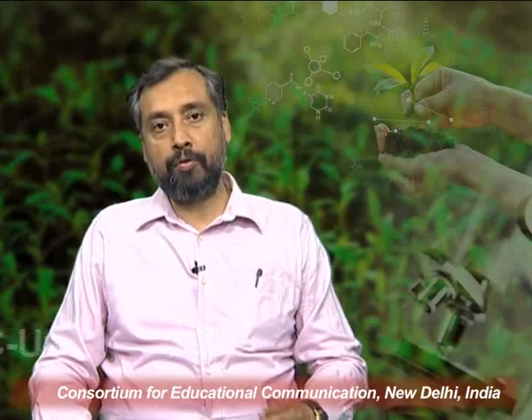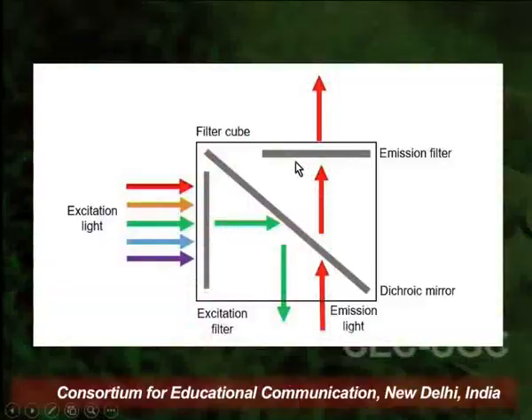In most of the fluorescence microscopes of reflected type, the excitation filter, dichroic mirror and the barrier filter are held together by means of a small block or cube-shaped filter holders. This cube-shaped filter holder is also termed as filter cube.